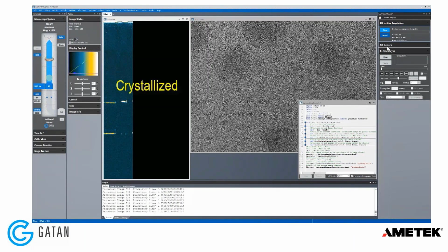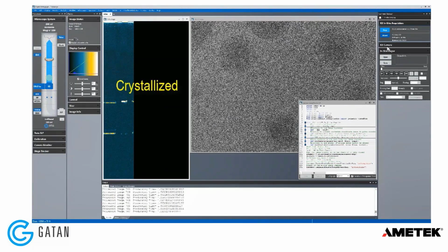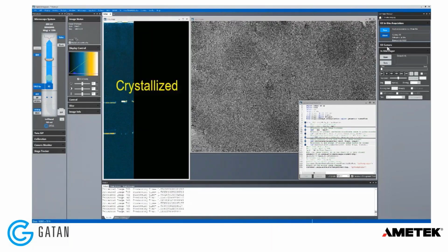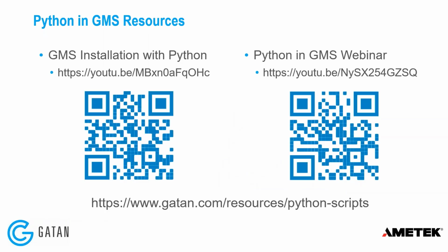If you're interested in Python in GMS, I just presented a webinar last month about Python in GMS, where we spent the full hour on that topic. So I'll refer you back to that. And sad I don't have time to talk about my last example at all. But you can go and look at that webinar on Python and GMS.